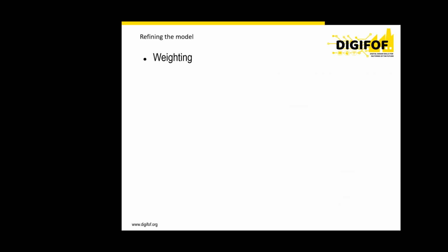So first, let's look at the weighing. Honestly, weighing needs special equipment or complex programming. For humans, it is relatively easy to do, and therefore we think that this is not a good target for automation. I mean, for example, handling a spoon or estimating weight when the mass is in milligrams.